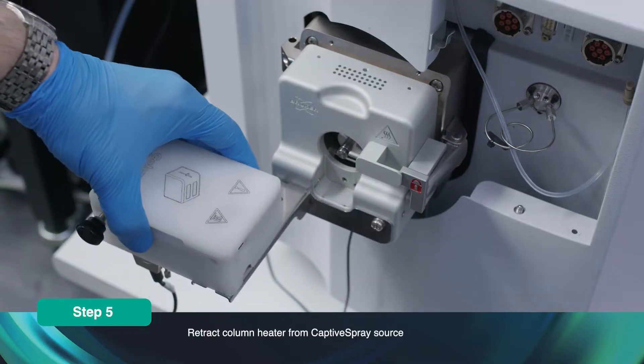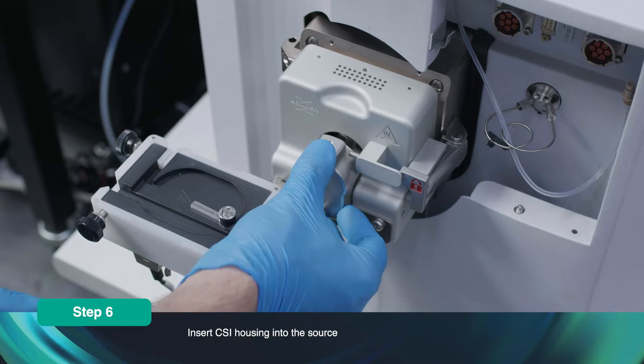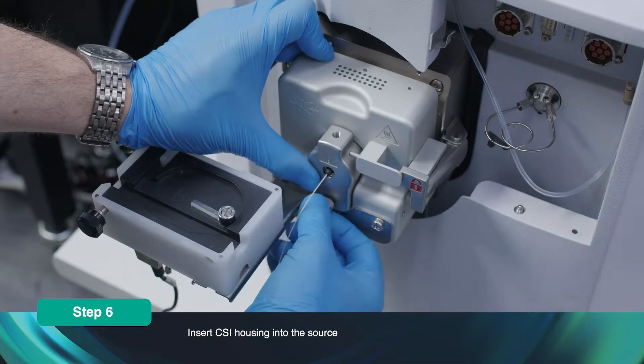Retract the column heater from the captive spray source. Insert the CSI housing into the source. Press with a small amount of pressure and tighten the screw until finger tight.